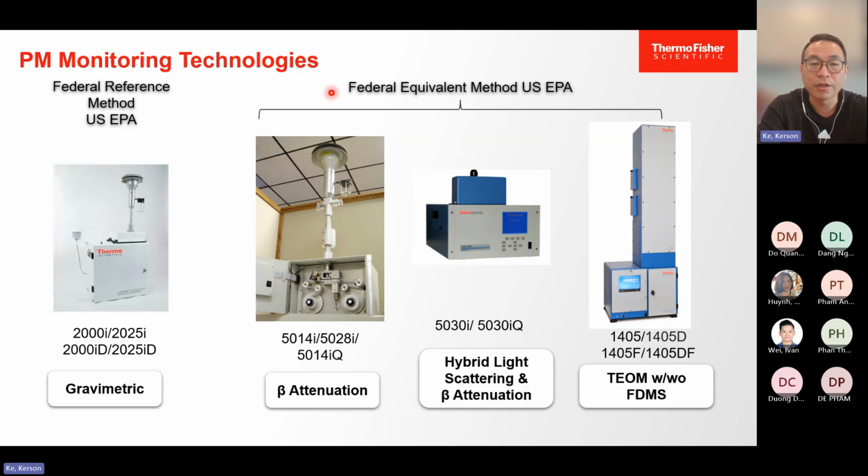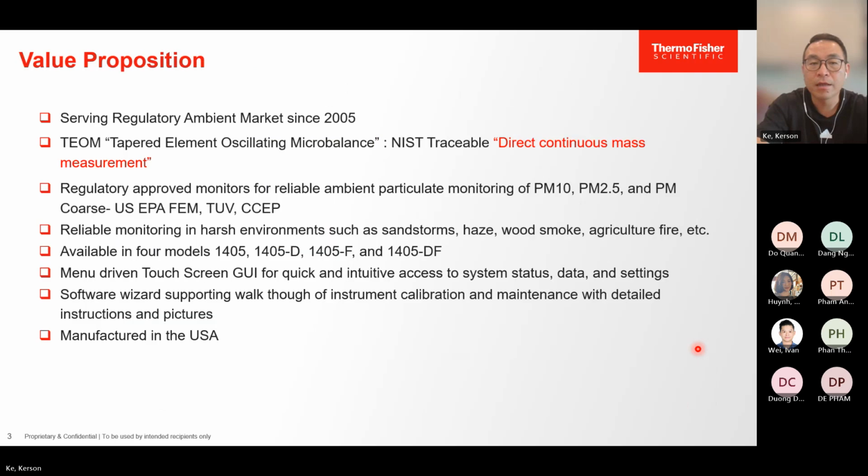So I think these three technologies I've already introduced to you. And today I will focus on this one, TEOM. Okay, so we have different models of TEOM. And let's say, what does TEOM mean? TEOM stands for tapered element oscillating microbalance. Actually, it's a microbalance. Okay, so it's like the manual sampling.